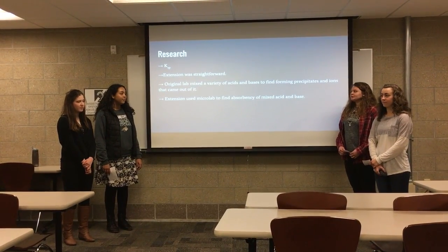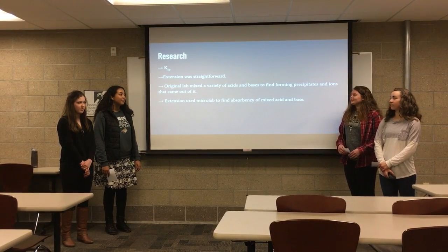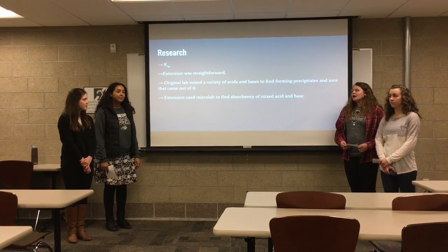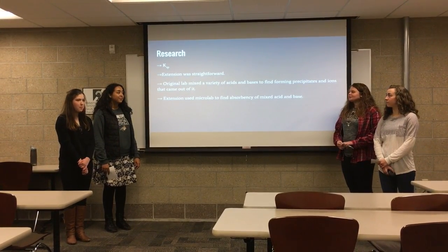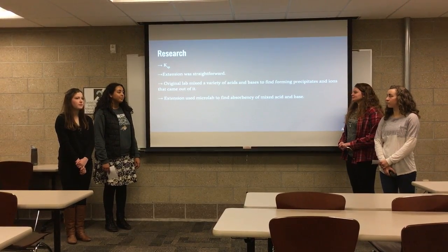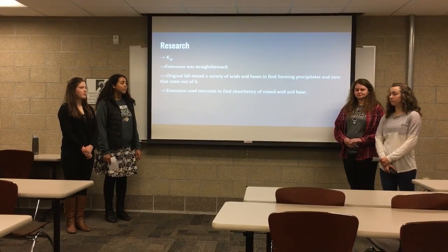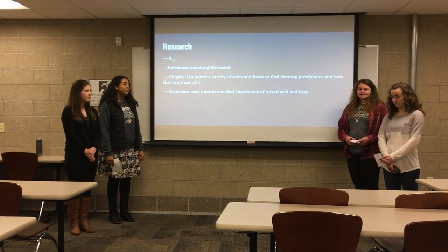One thing that was really different about the original lab and the extension was the Ksp value, which is the solubility product. And that was basically the biggest difference, besides the fact that we used the microlab instead of mixing acids and bases to pull out different ions and then spot testing.